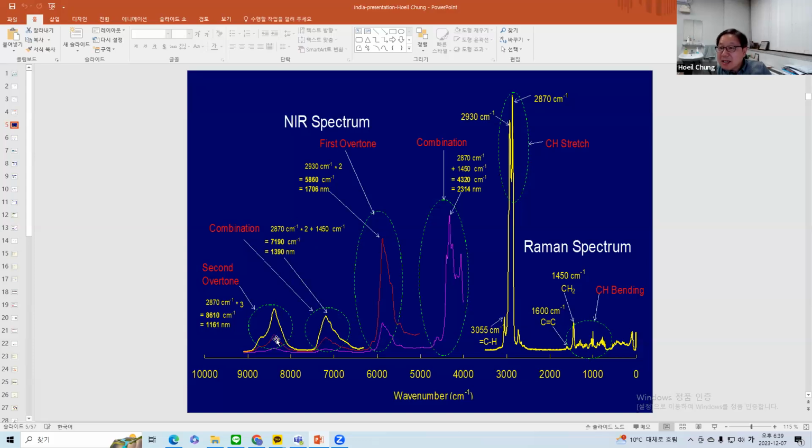So what is important here is that in the NIR range, the spectral features, I mean the selectivity, means how sharp the peak is. As you can see in this range, 5,000 to 4,000 wave number, the spectral features are most clear. And if the range is further from the IR range, you can see spectral features are getting broad. So that means if we want to have a good analysis, obviously it depends on the sample system. If the sample matrix is very simple, it doesn't matter. But if you are dealing with a complex sample, you might want to use this range for your analysis. That is very important based on my experience.